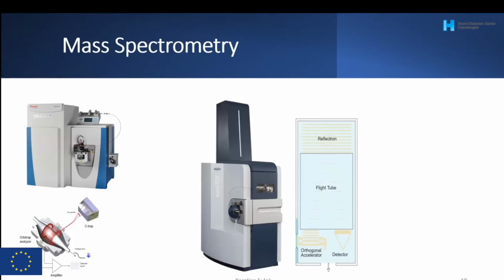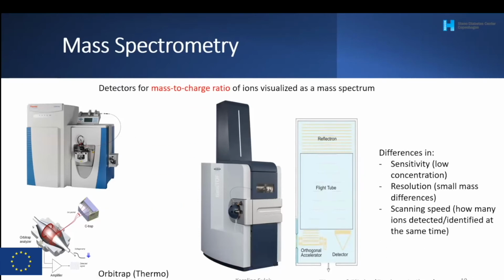How the ions are detected is inbuilt, but each design comes with different properties in terms of sensitivity, which means how low in concentration or abundance of the molecule we can go.